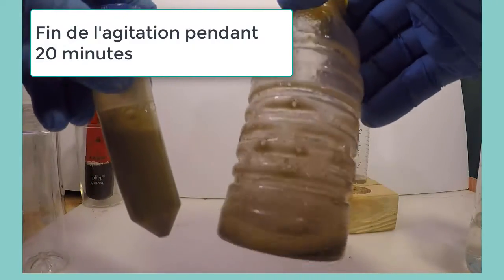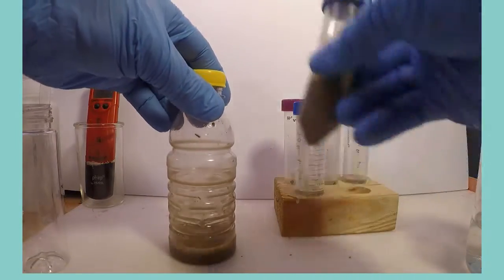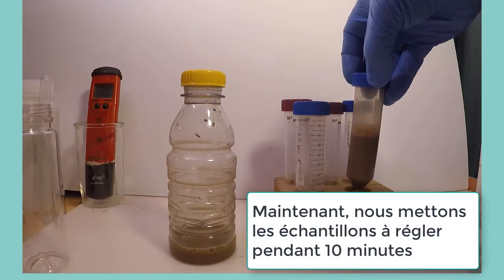Now the 20 minutes of shaking are over, and we will leave the samples sitting to allow clays to begin to settle from the solution. The bottles or tubes need to settle for 10 minutes.